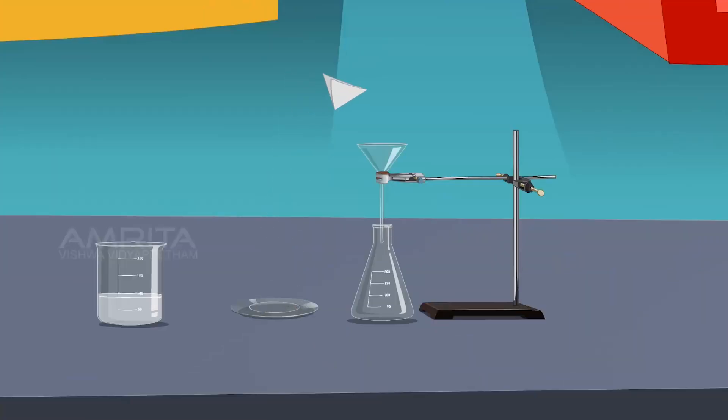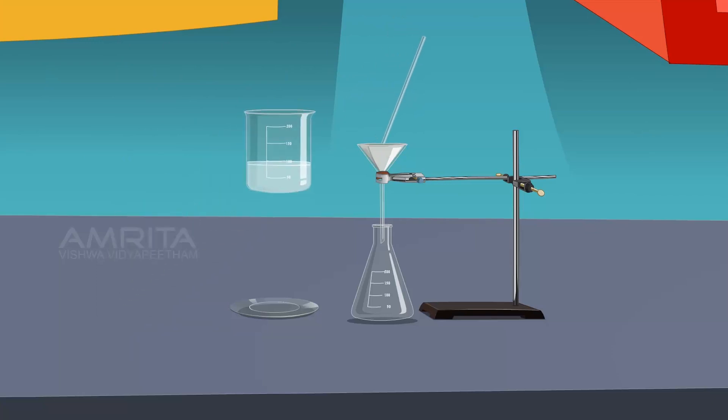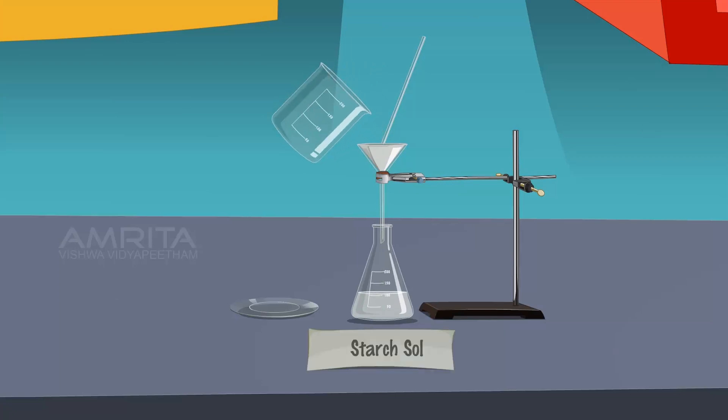Fix a filter paper in a funnel which is fixed to a stand and place a glass rod over the funnel. Filter the contents of the beaker through the funnel and collect the filtrate in a conical flask. Label the filtrate as starch sol.